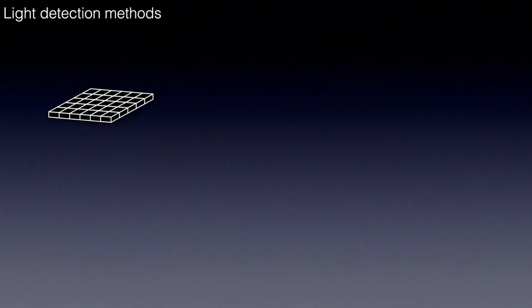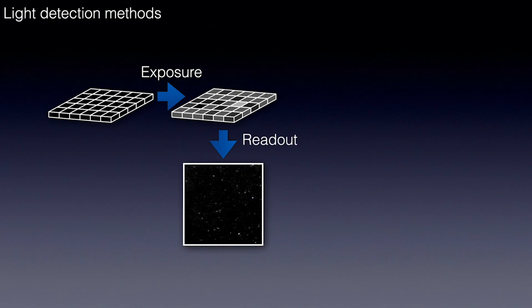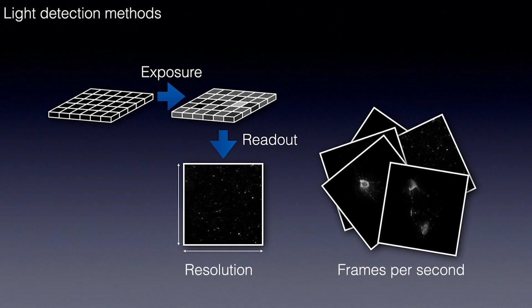From my experience, when I say camera, everyone immediately has this in mind: the CCD chip, the matrix of light-sensitive pixels. To use this chip, you expose it to light. Then you read the data out, and what most people are interested in is how many pixels we have here and how many frames per second I can get.